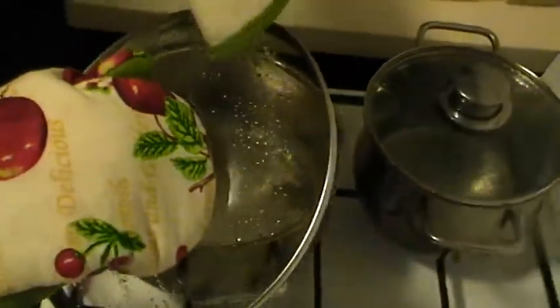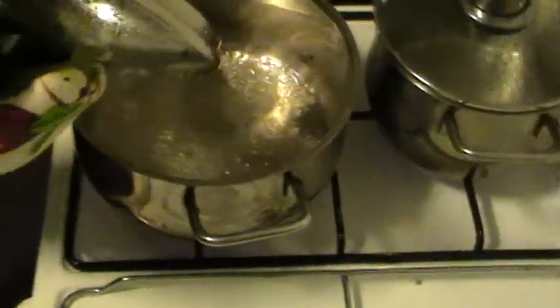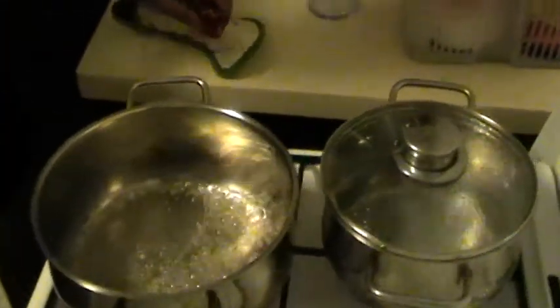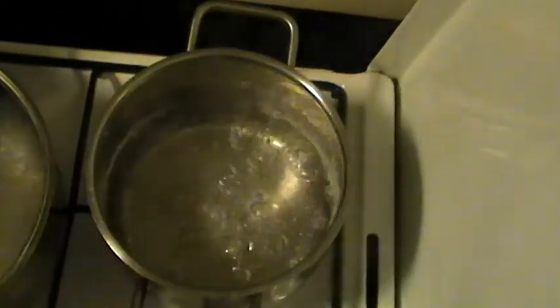You see there's a lot of condensation on the lid of the cover because we've been letting it condense. The steam has been condensing on it. And there's loads of bubbles. We're gonna have a look at the salt water.